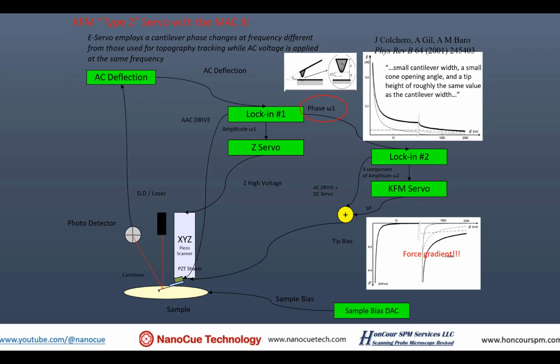Yeah, I think that was a graphite sample that was cleaved, and it's really surprising how long, or basically you can measure how long it takes for your sample to become contaminated.